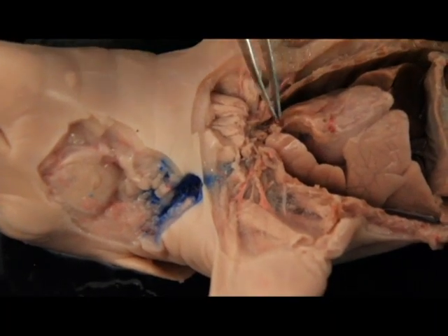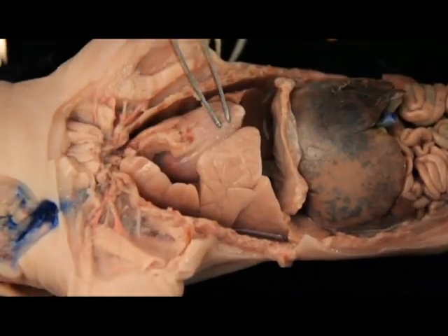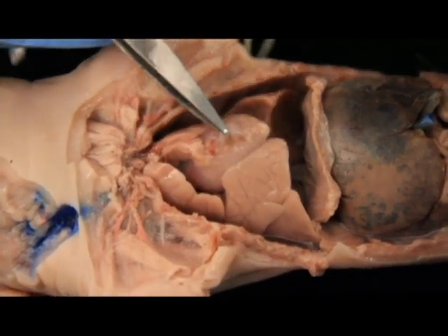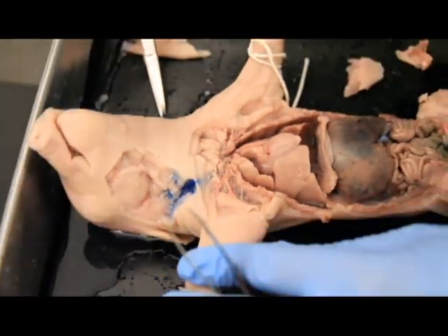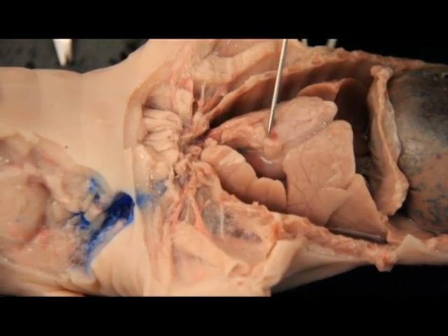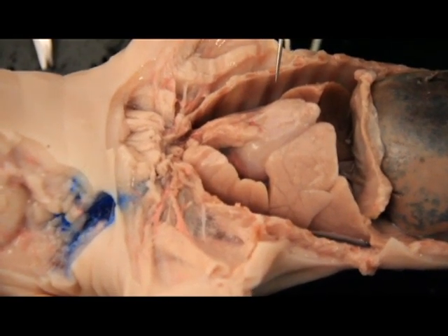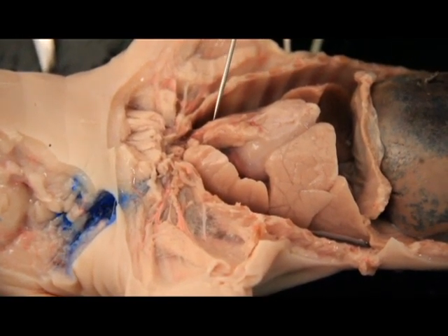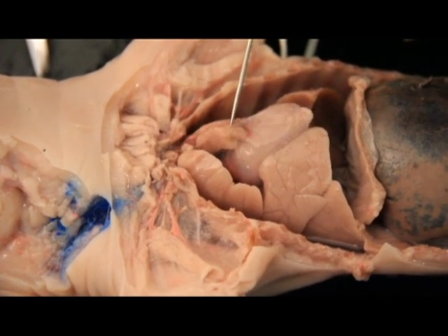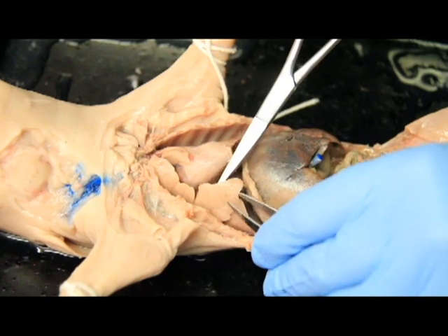So you can see here we've really exposed this chest cavity. You can see our big lungs on either side. You can see our heart still covered in that pericardial membrane, this very thin membrane right here. And then sitting on top of that pericardial membrane is the thymus. The thymus is this flat looking, almost gland looking guy sitting on top of the pericardium. Now once we get onto the pericardium, there's going to be auricles and all sorts of other stuff. But we need to remember that if we're on top of the pericardium, then it's going to be our thymus right there. Good.